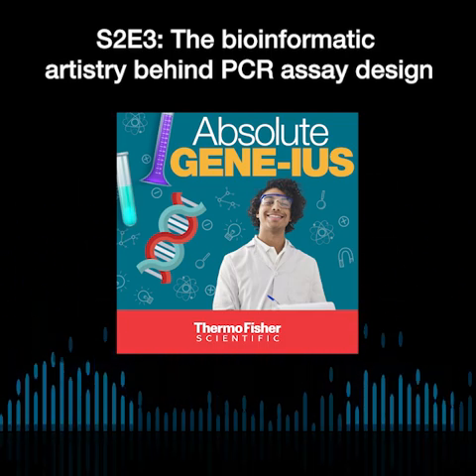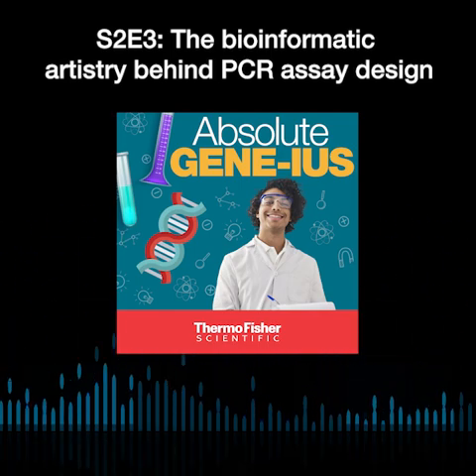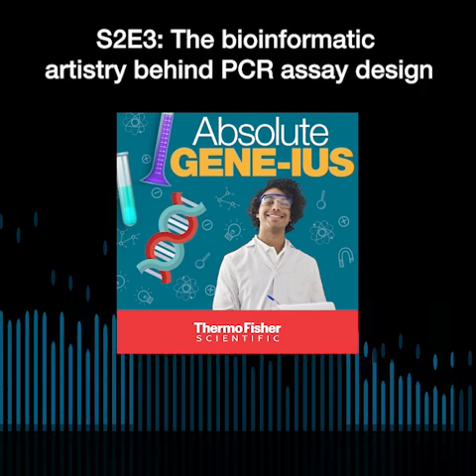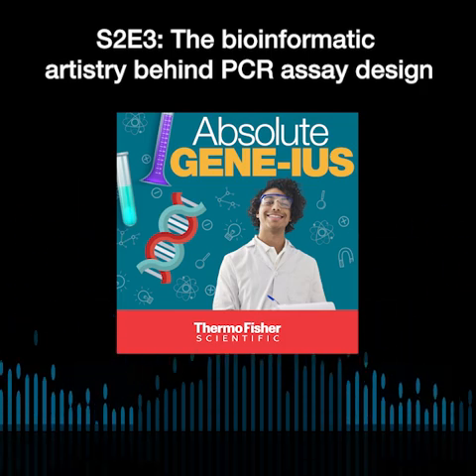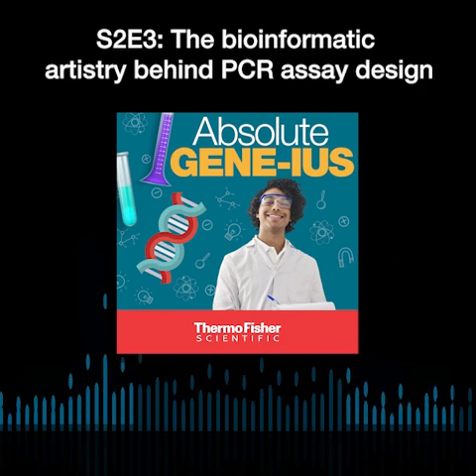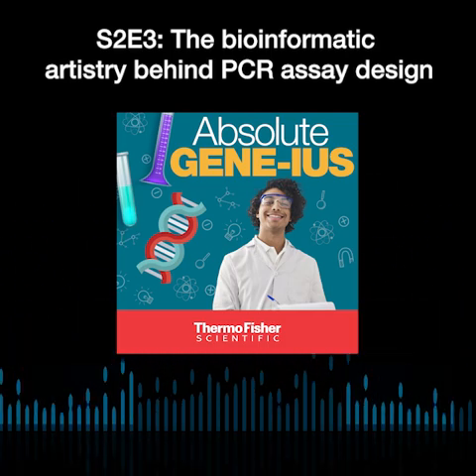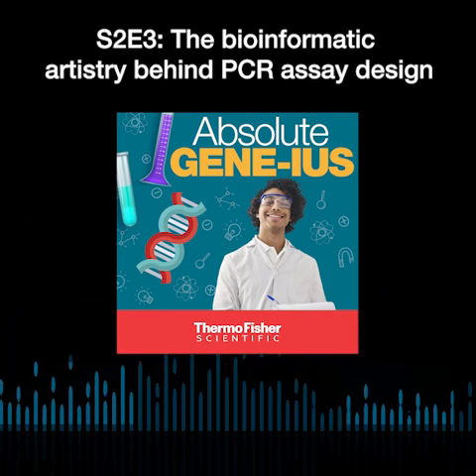How about your proudest moment? My proudest moment is probably a multiplex that I'm currently working on, and it came from being given the target, and then I did all the research, found the target sequence, designed the assays, and I just on Friday tested the multiplex, and it's working. Yes, Kimi! Celebrate! And this is my first assay that I have supported fully from design through to testing in the wet lab. Well done. We're proud of you, Kimi.